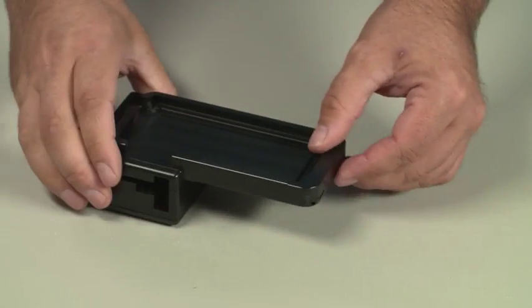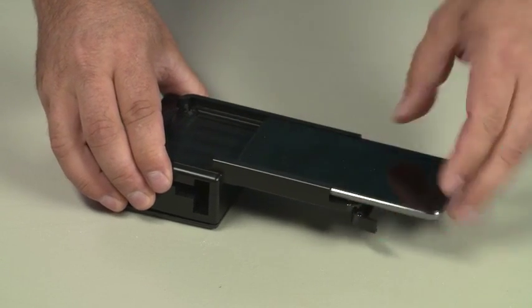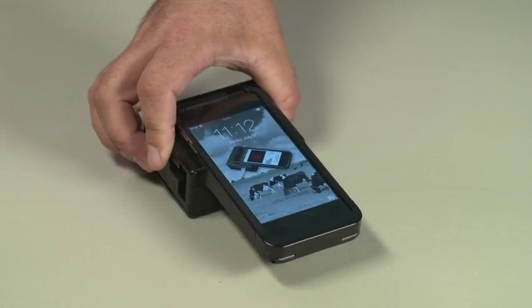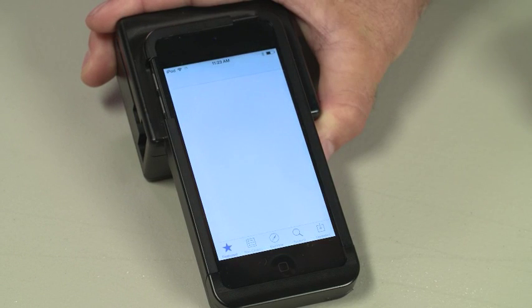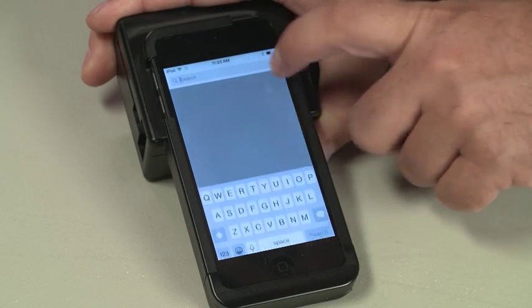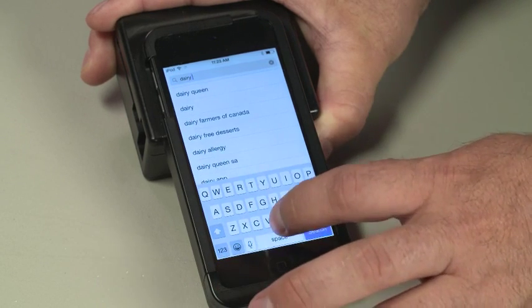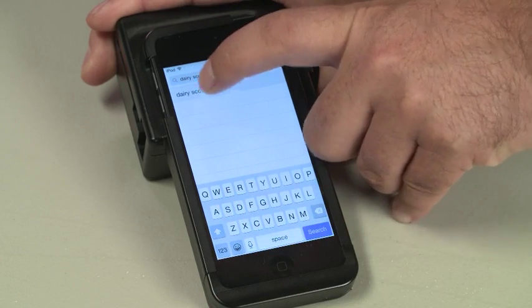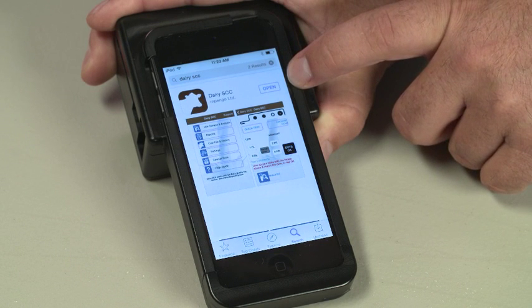Turn the RT10 over, open the front latch and insert your iPod or iPhone. Turn on the device. To load the Dairy SCC app on your RT10, tap the App Store app on your device. Tap Search in the app. Enter Dairy SCC in the search field. Tap Open or Purchase.